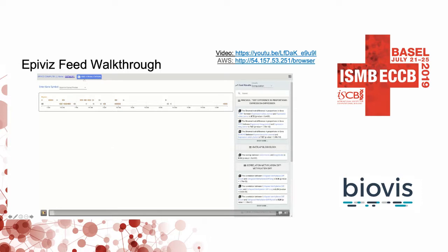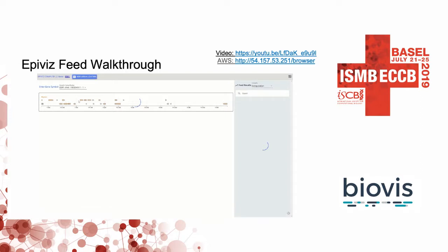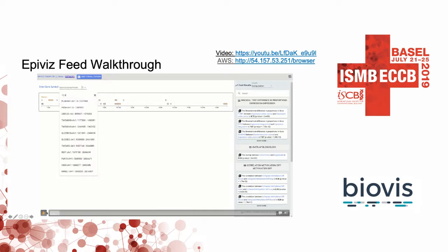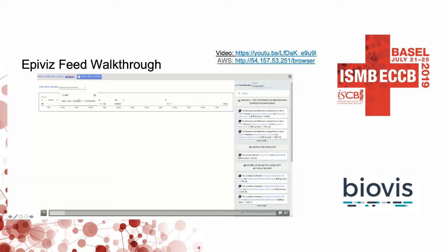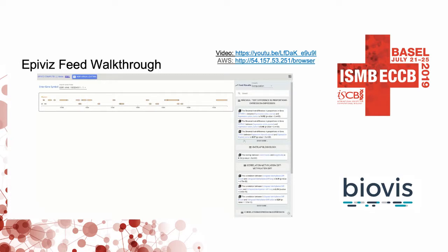As with any genome browser, you start with your gene of interest. In this case, I'm choosing ESR1. Once you choose ESR1, it triggers a request to the computation server that automatically runs a set of analyses, and the results show up as a feed in the right sidebar.